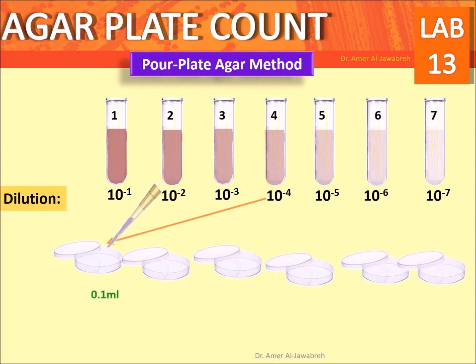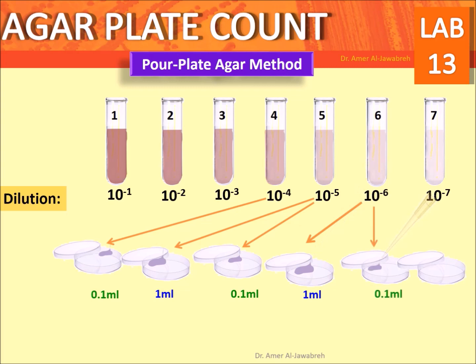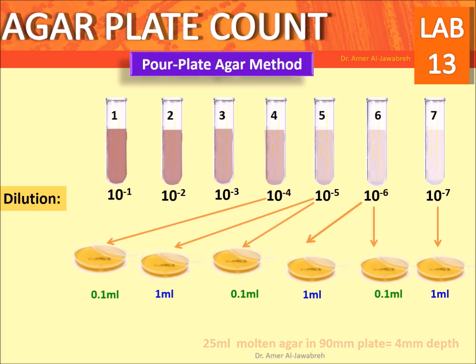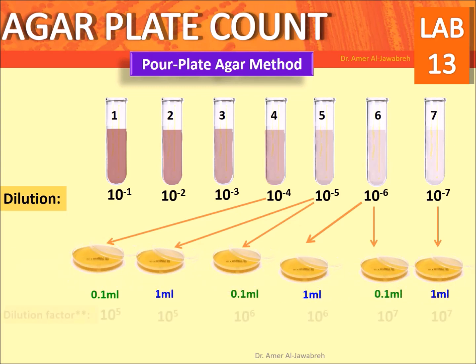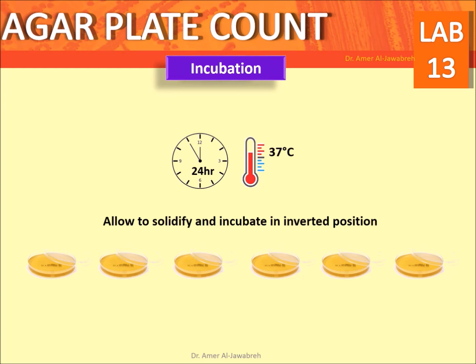Take 6 labeled 90 mm plates. Choose the highest four dilutions. Transfer 0.1 ml and 1 ml of bacterial suspension to plates as shown. After this, add 25 ml of molten agar — equivalent to a depth of 4 mm. Swirl gently to mix.